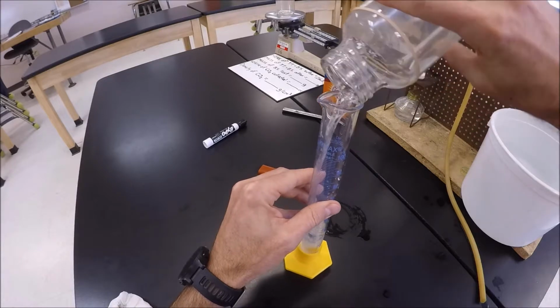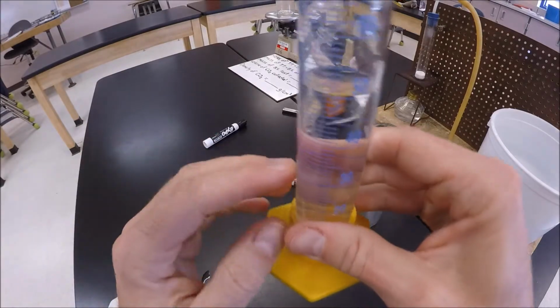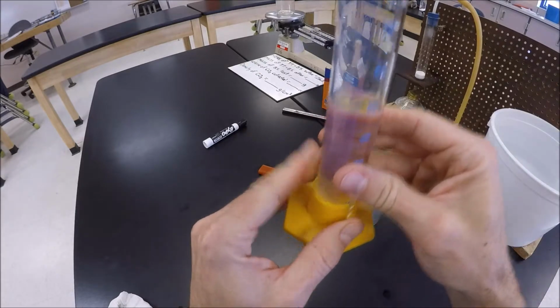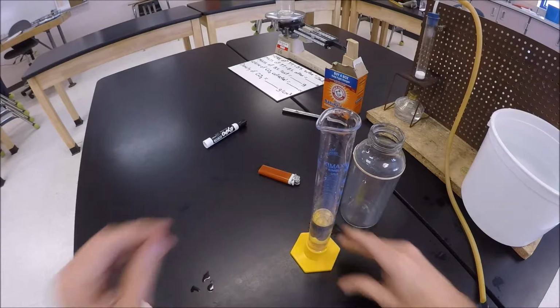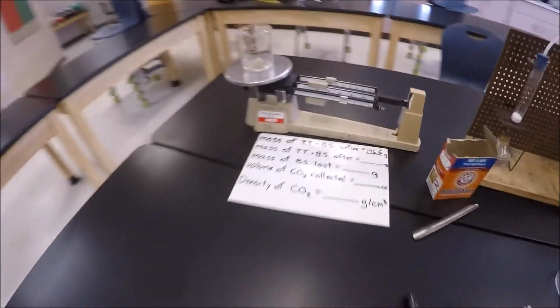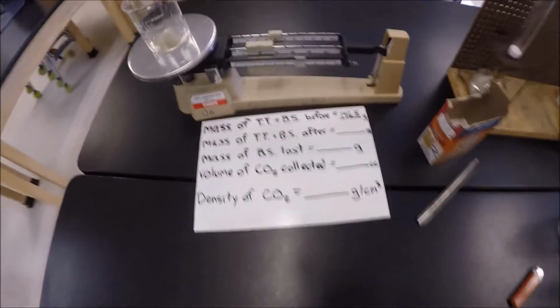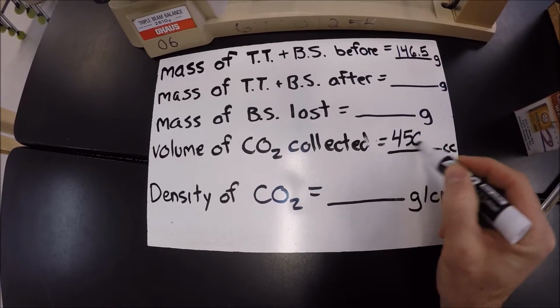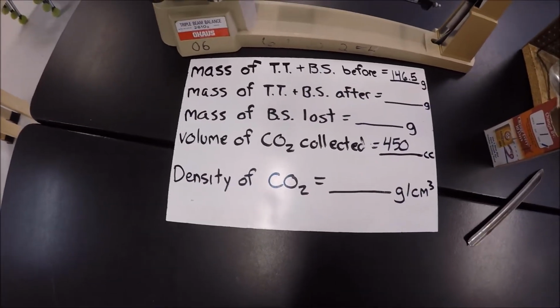So let's see here. The volume of our gas looks like right about, you can see that, I know it's hard to see from the camera. I'll look at it from eye level. Wow, right on the mark, 450. It's a nice even number to get. So I'm going to go over here and write: volume of CO2 collected here is 450 cc's or milliliters.